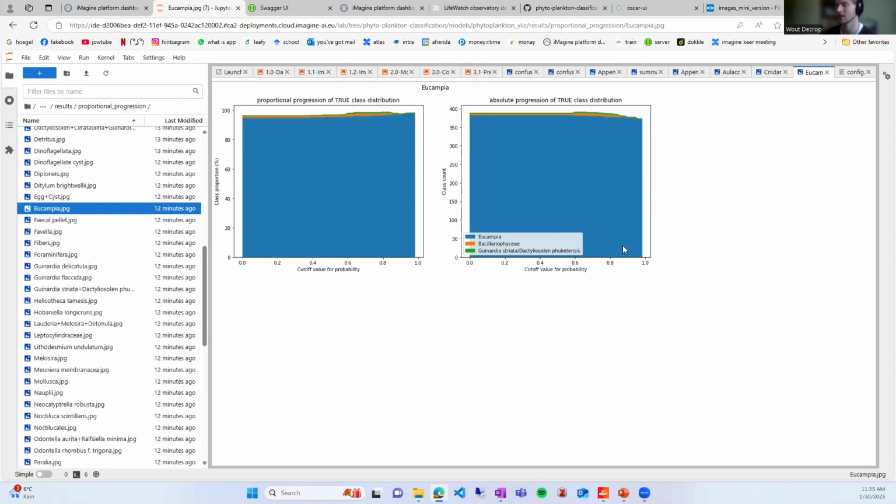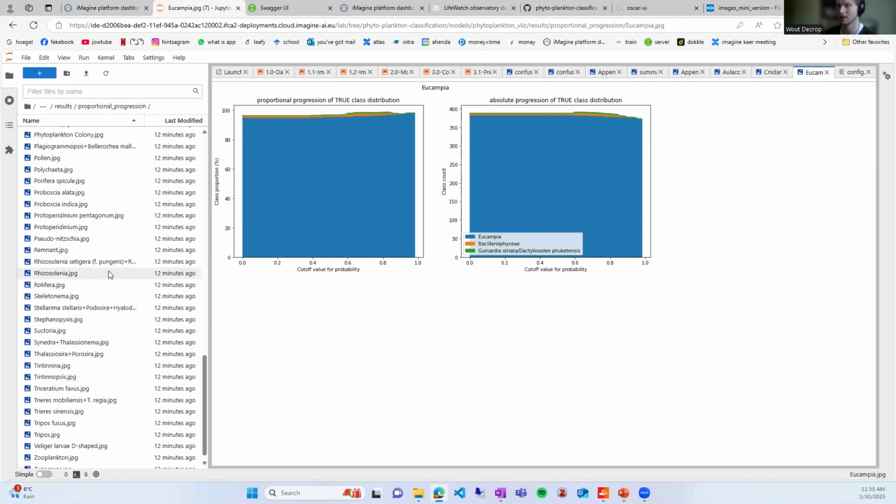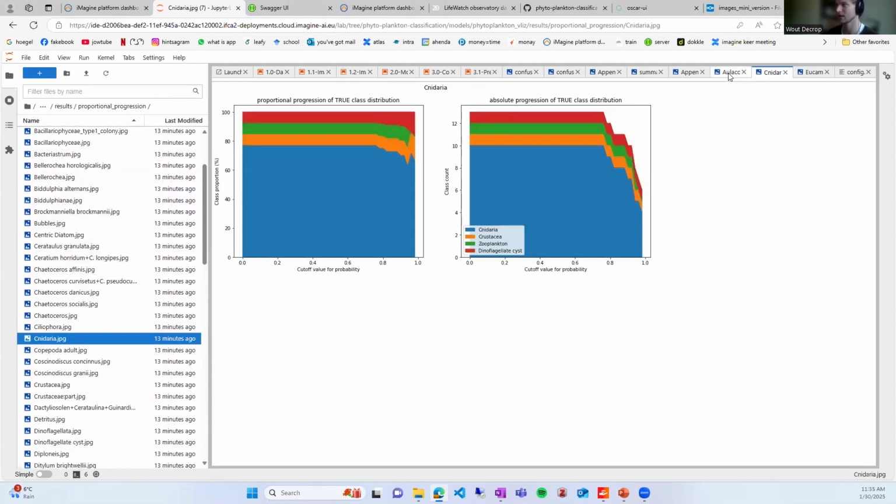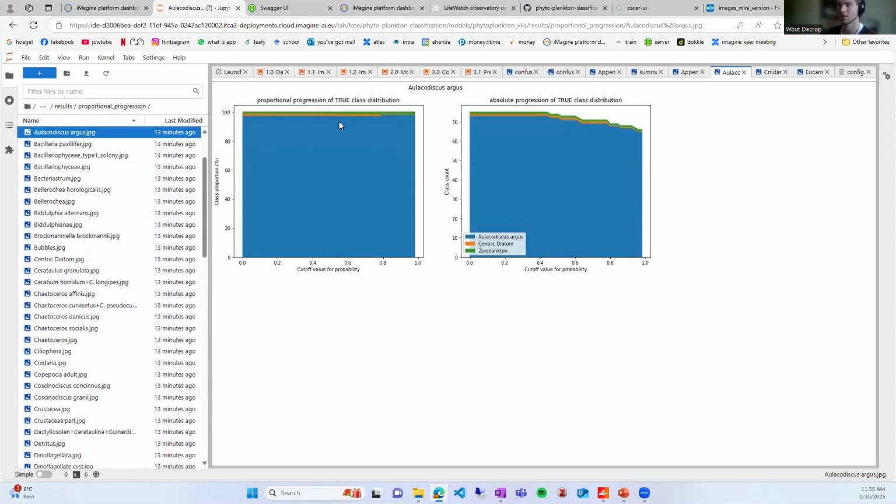So you can say, hey, for this class, if the model is 99% correct, you don't even have to look at it anymore. It's correct. And if it's below it, you can maybe check. So it really can be a case-by-case comparison where you go through all these images and then say, for this class, if you're fine with 99% accuracy, you can just leave it be.